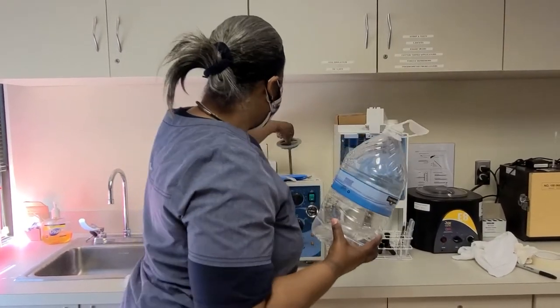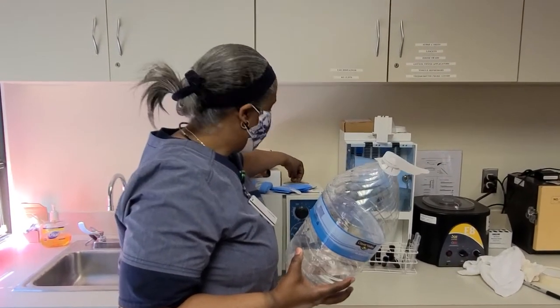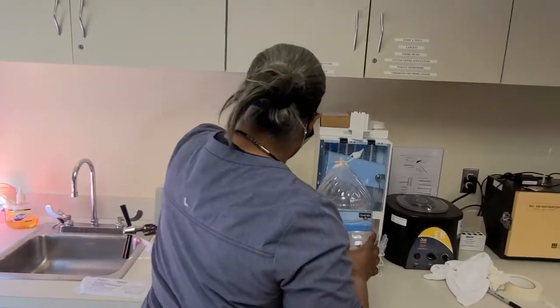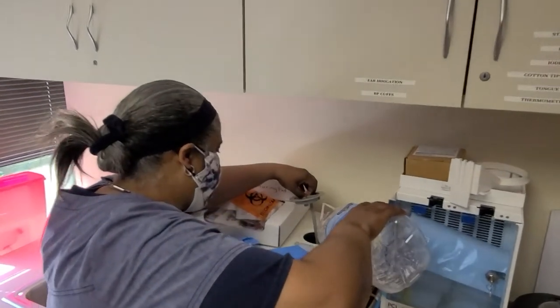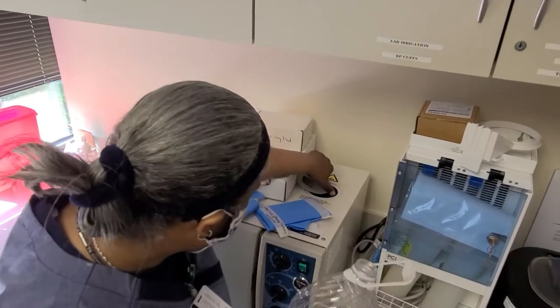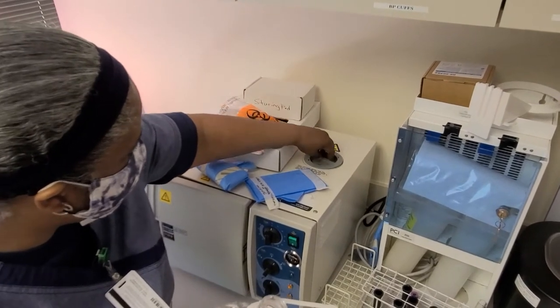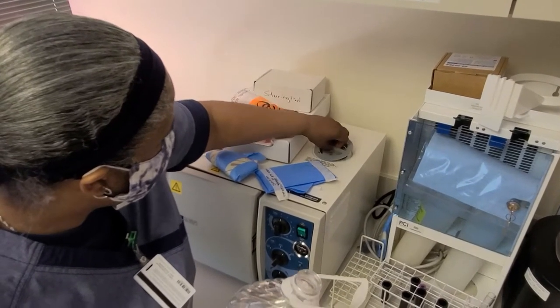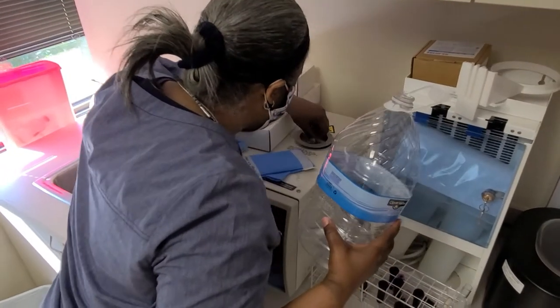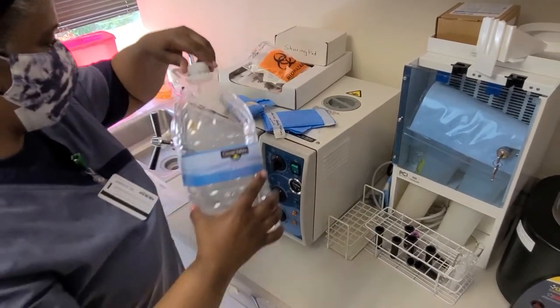Now, this one here has it so that you can pour it in there. And then as you're pouring, this would rise up. But I usually make a mess when I'm doing that, so I'm just going to pour by opening this. And there's a line that you'll be able to see in here. There we go. And I can see that it's mostly filled, just enough of what I need. Then I'm going to put this back down. Oops, on the wrong side. Here we go. Okay. So now I've got my distilled water in here.